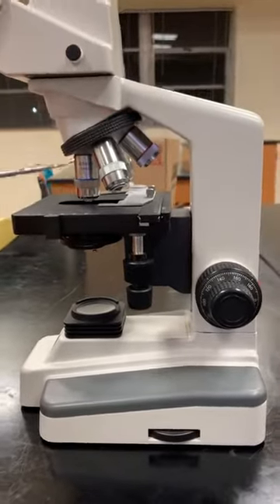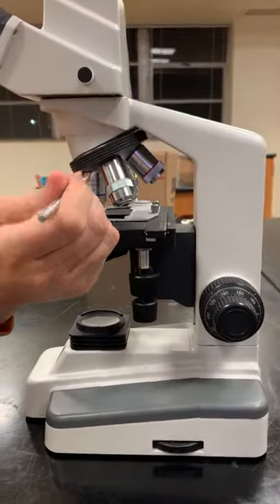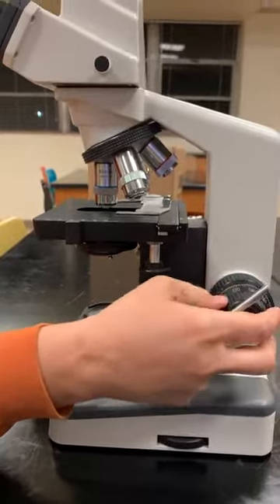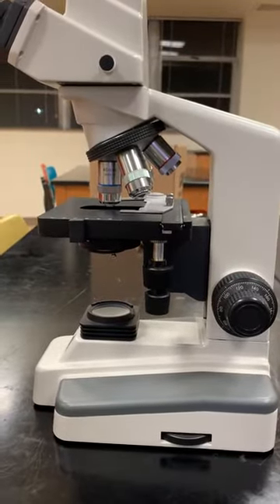When you use your high power objective lens and your oil immersion objective lens, you only use the fine focus so you do not scratch or damage the front of the slide.